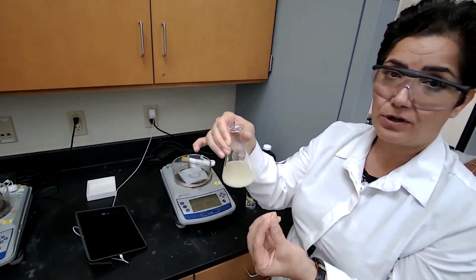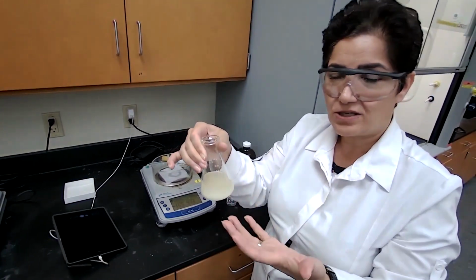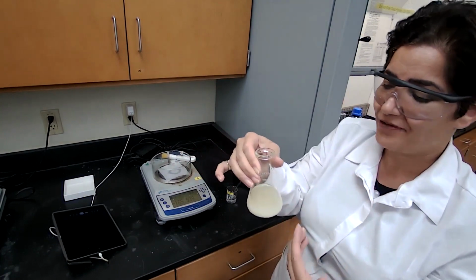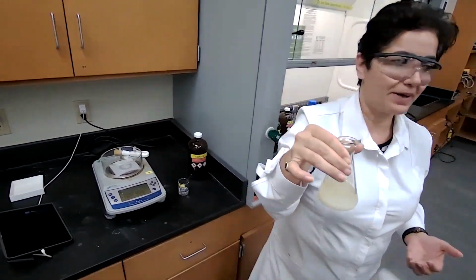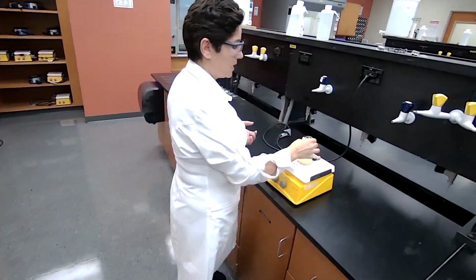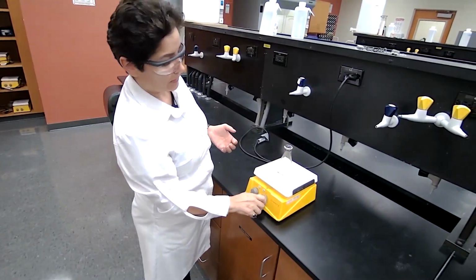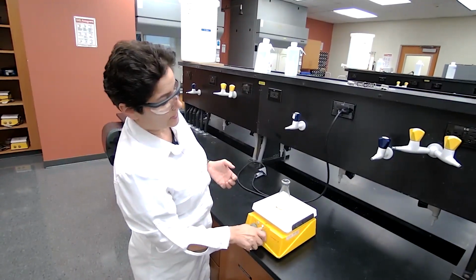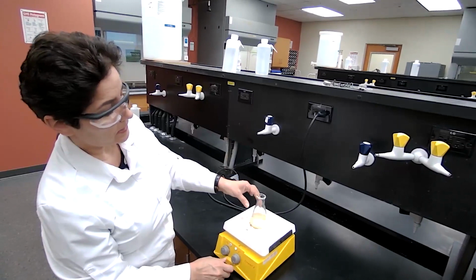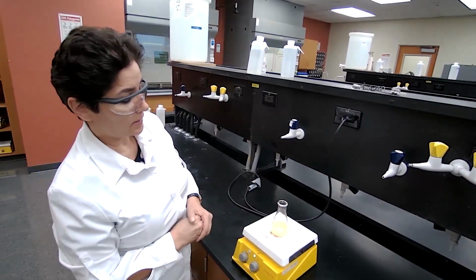The product is yellow color, but this reaction takes time. It doesn't need high temperature, but it takes time, and we have to stir it constantly. It takes about 30 minutes. So we are going to leave it on the stirring with the magnetic stirrer, and it will spin for 30 minutes while the product is forming.